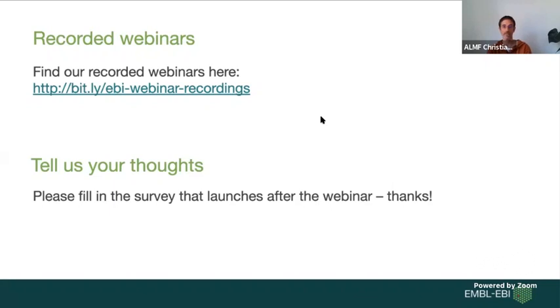Then, when I repeat an experiment and have different background noise in different repeats, is it possible to automatically yet dynamically adapt the thresholds? Yes. So there are many automated thresholding algorithms. Also in Fiji, actually, there's a very nice, I can type it. I think it's called auto threshold, and they have a very nice try all function.